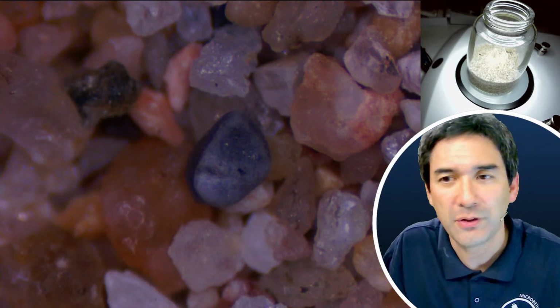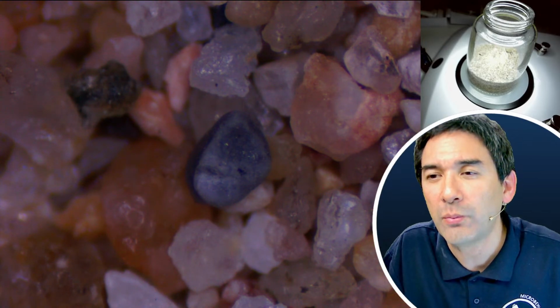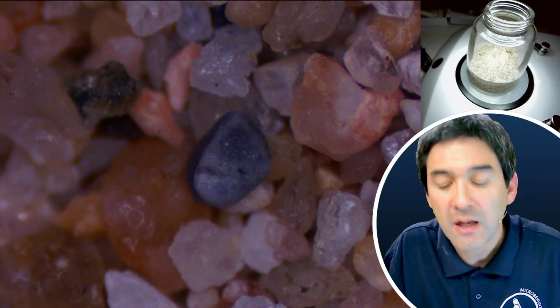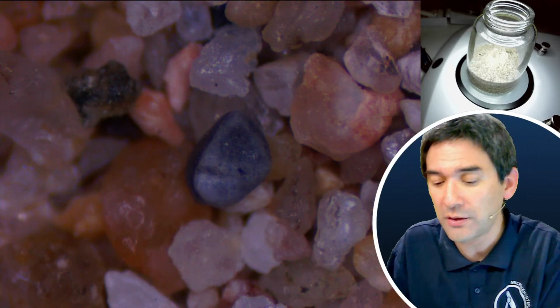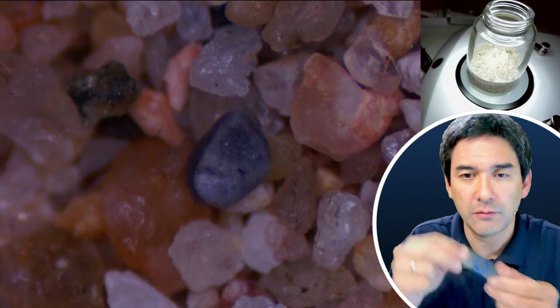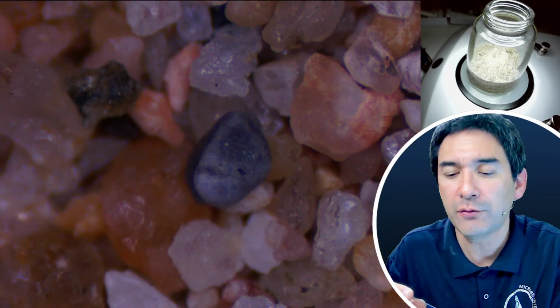Could there be problems if you simply use 5 or more layers of nail polish instead of a spacer ring and let each layer dry thoroughly? It just takes time. I've tried that, and it actually works. Okay, I don't see a problem really. I mean, here this is actually one of 3 or 4 layers, and I've tried that.